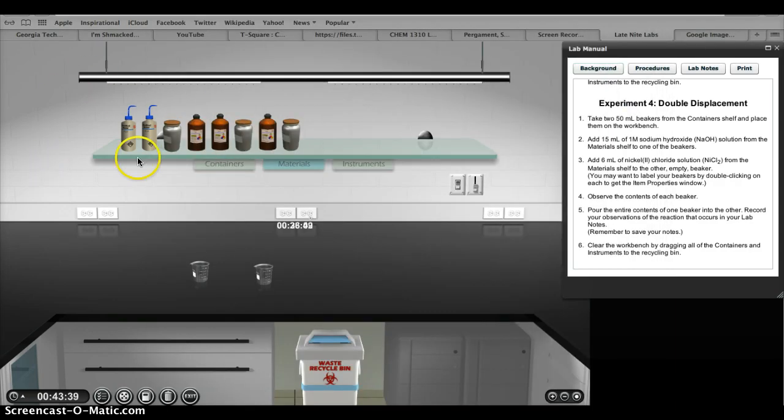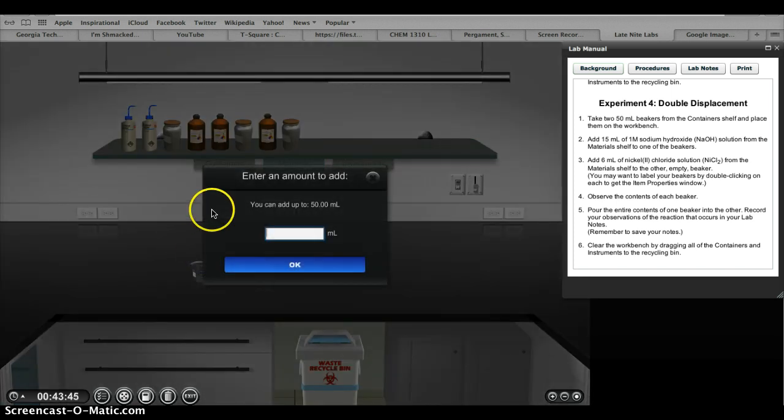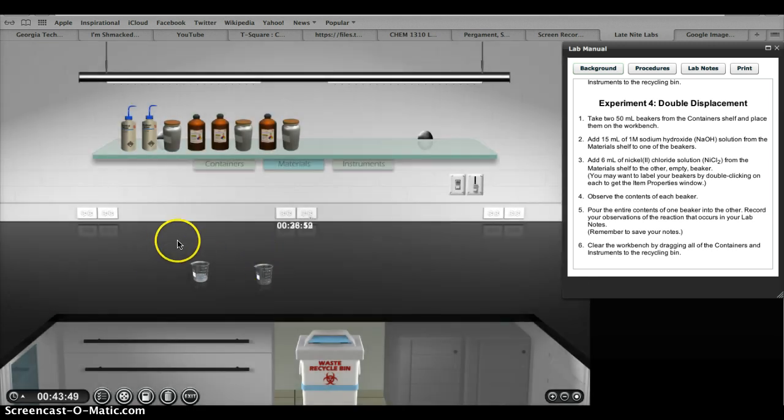Okay, so to perform the reaction, we're first going to add 15 milliliters of sodium hydroxide to a beaker. And it is aqueous, therefore, it is a uniform solution, and it is clear.